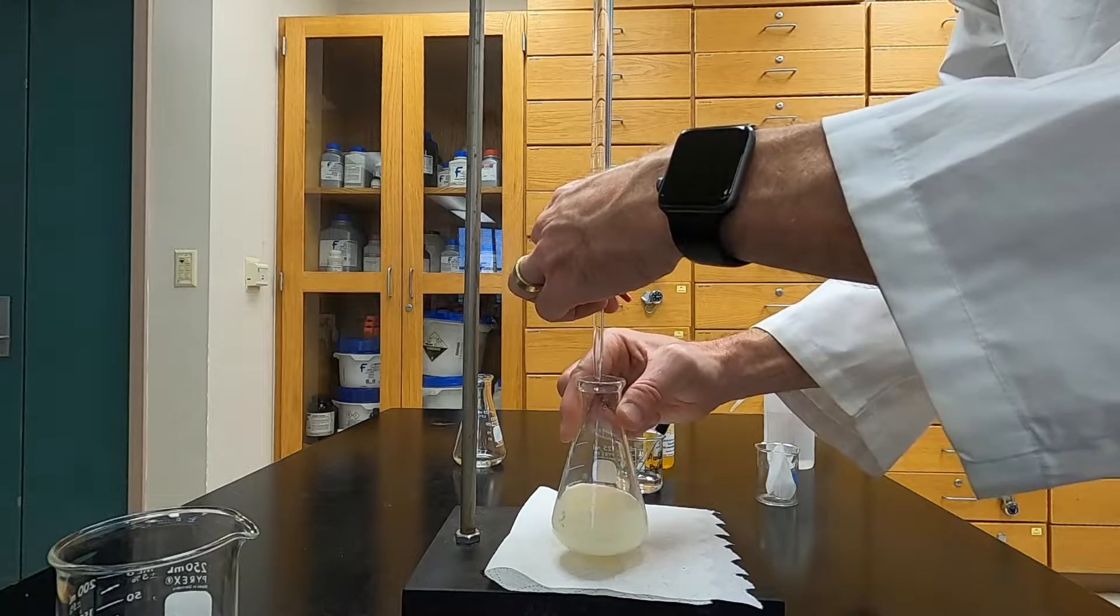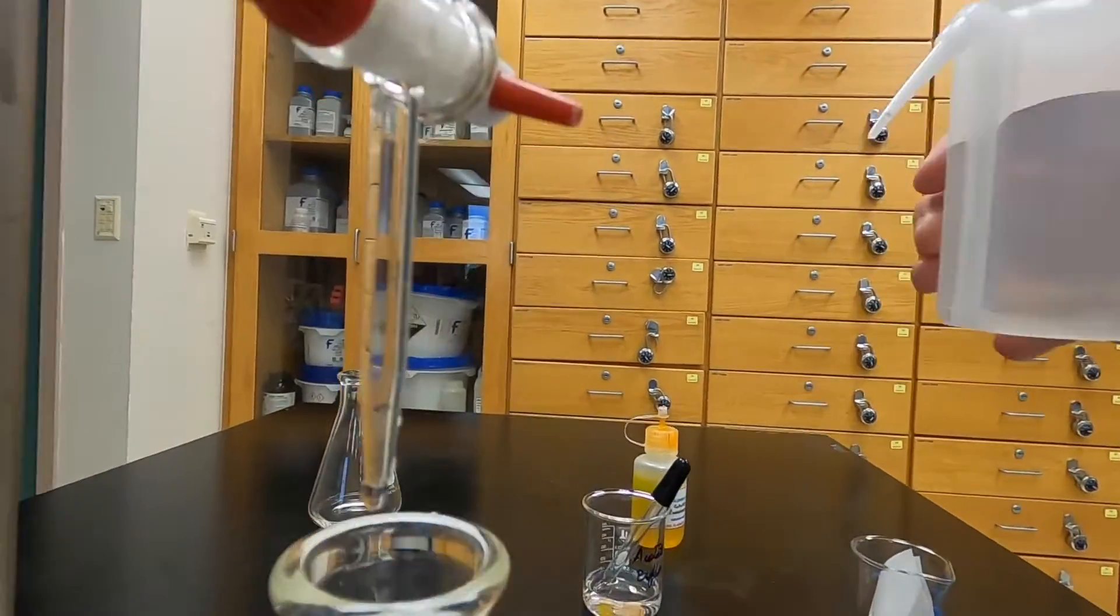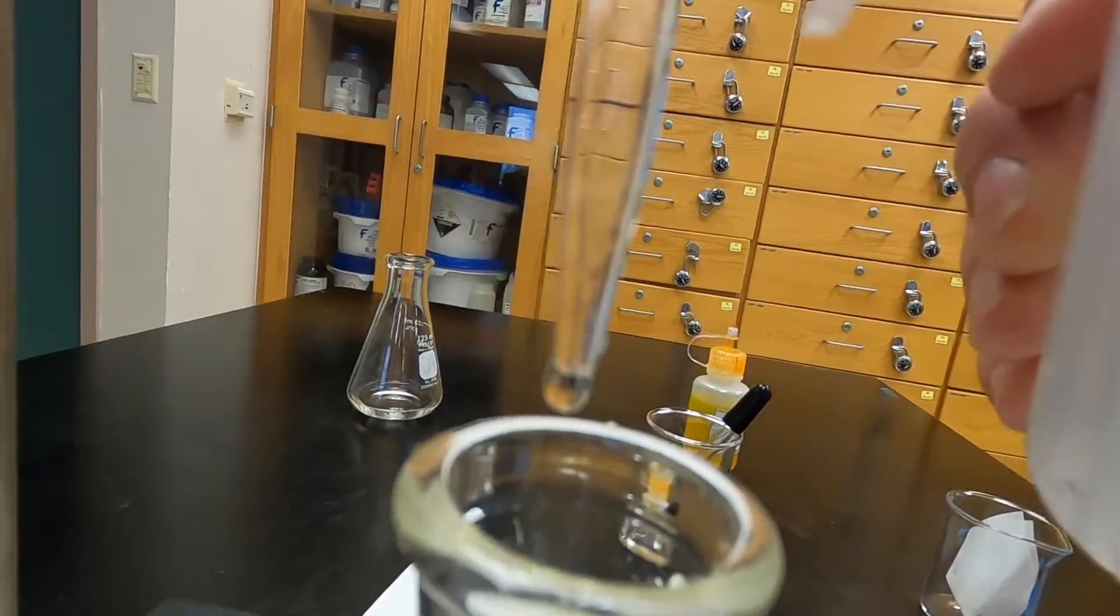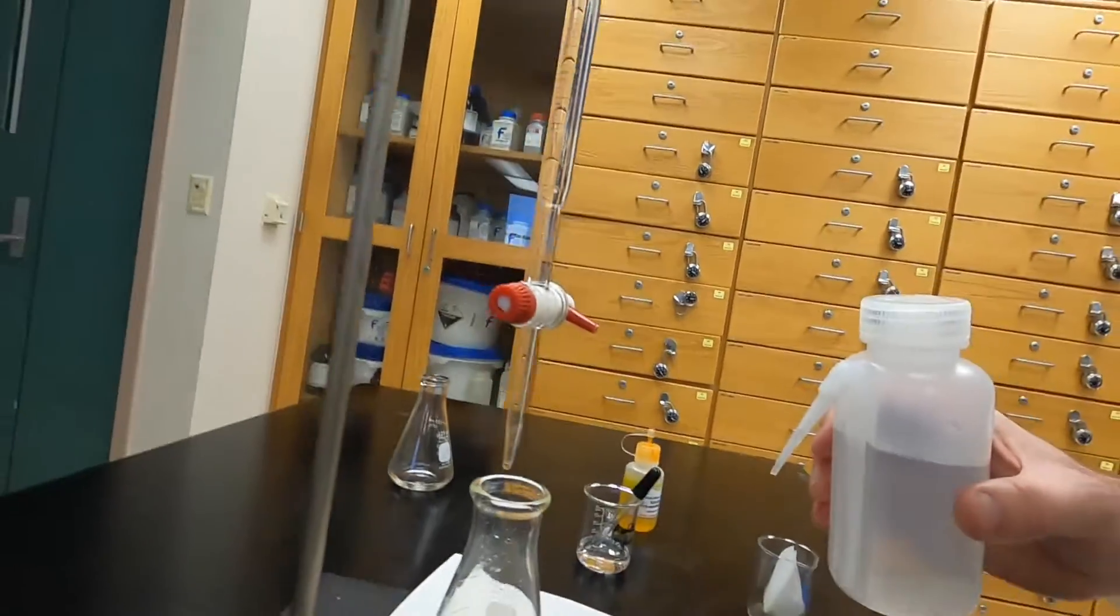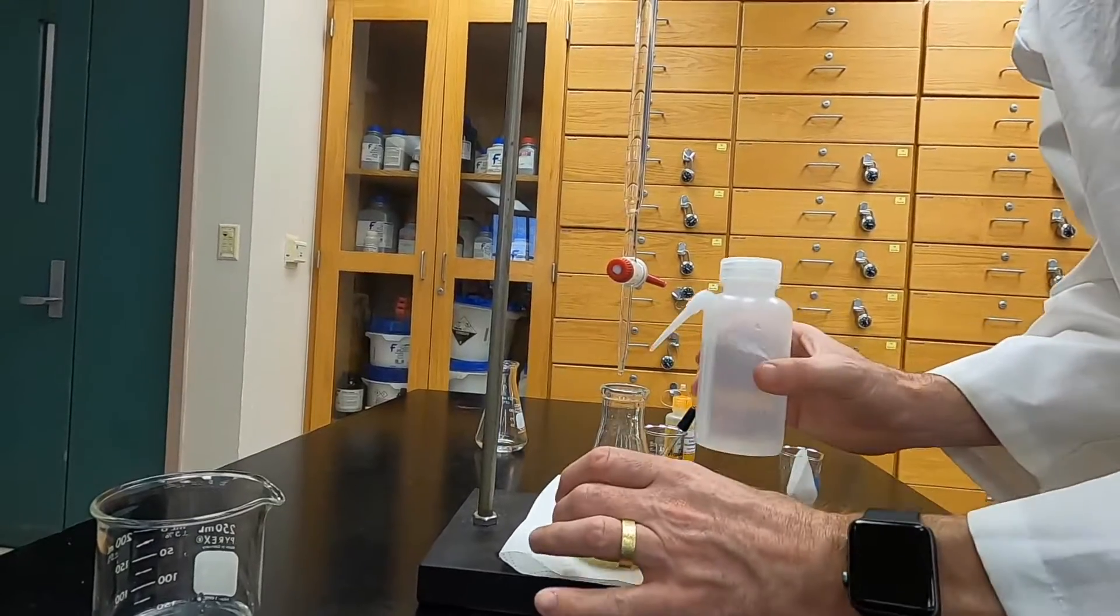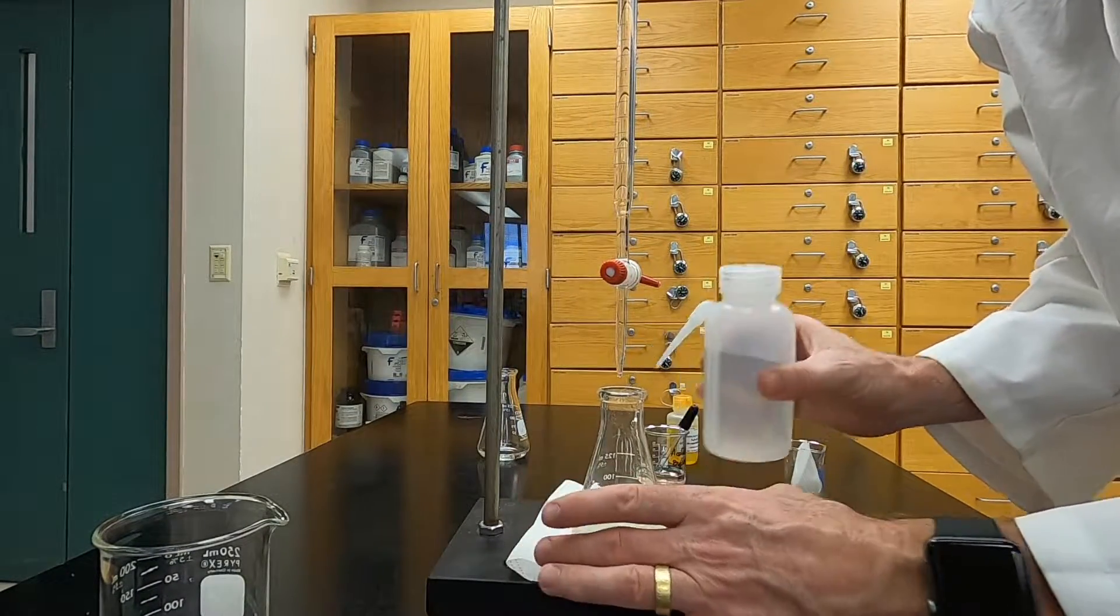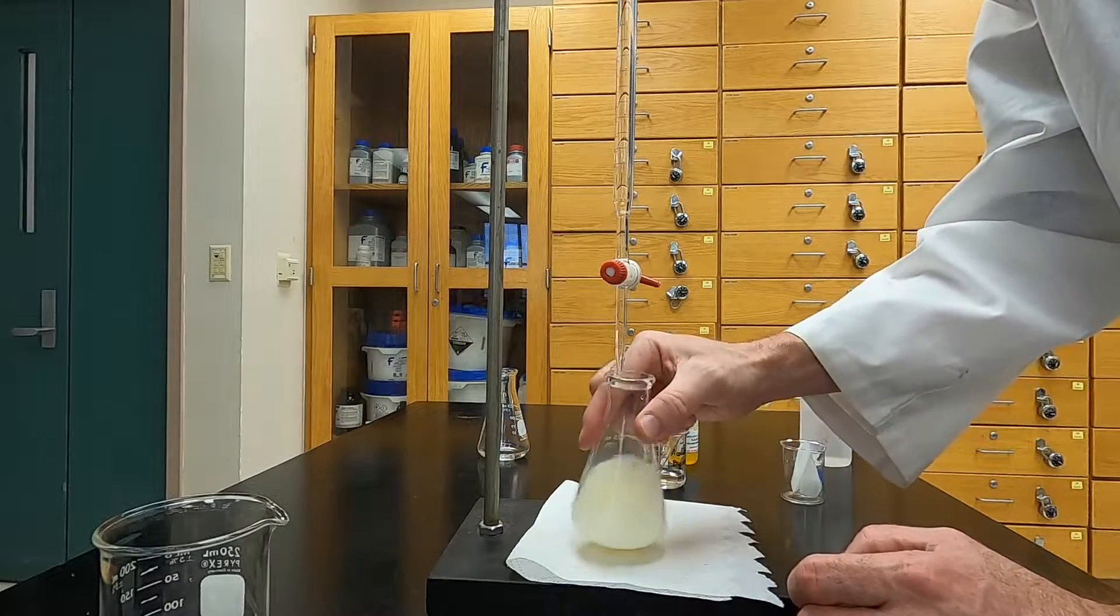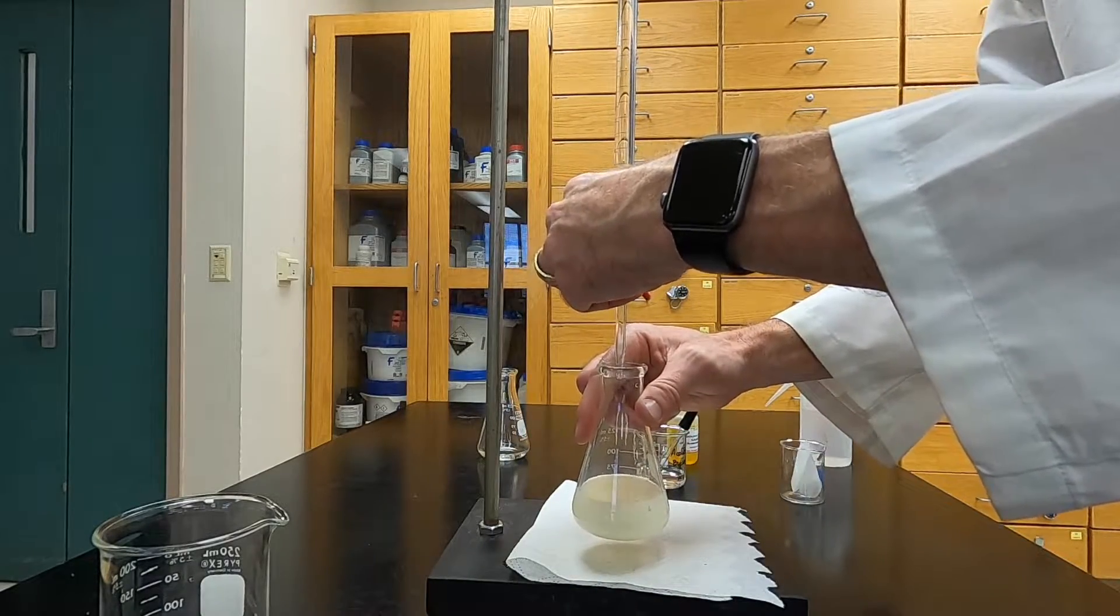One way to ensure that you're reaching your equivalence point as accurately as possible is to master the partial drop technique. Here, some of the titrant is still hanging from the tip of the burette. By using a stream of water, I can carefully spray that solution into the flask, rinse down the sides of the flask, and now I've delivered less than a drop of solution. This can be crucial in hitting the exact endpoint you're looking to reach.